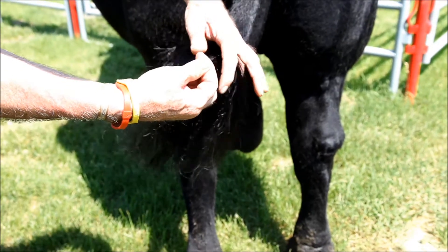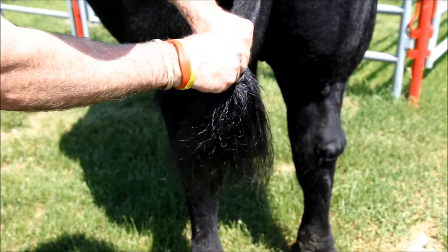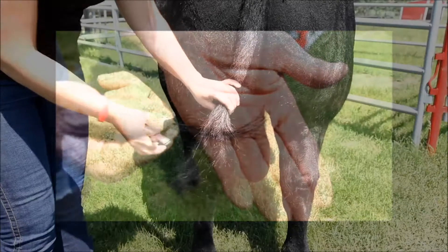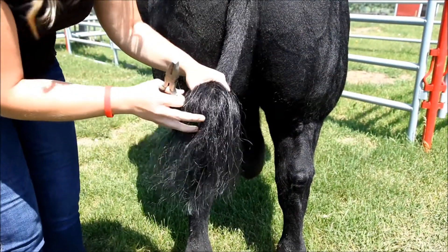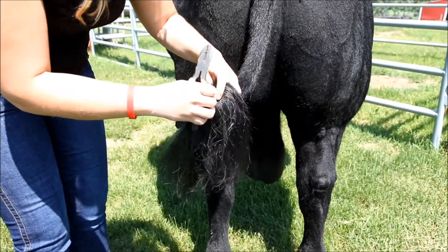Next, you want to locate the tail ball — this is where you're going to be pulling your hair from. You want to wrap a chunk of switch hair, about 50 hairs, around pliers or your finger and give a sharp downward pull to ensure that all the hair follicles come with. Without the hair follicles, you cannot get a DNA test.